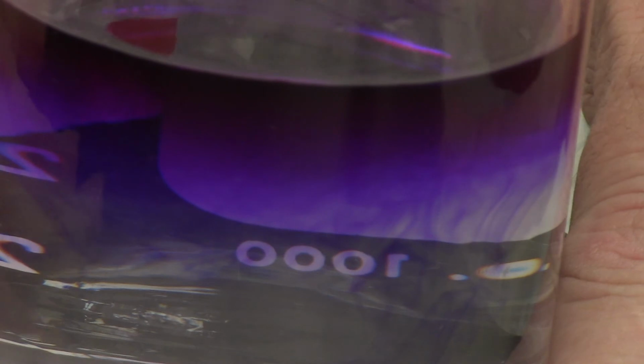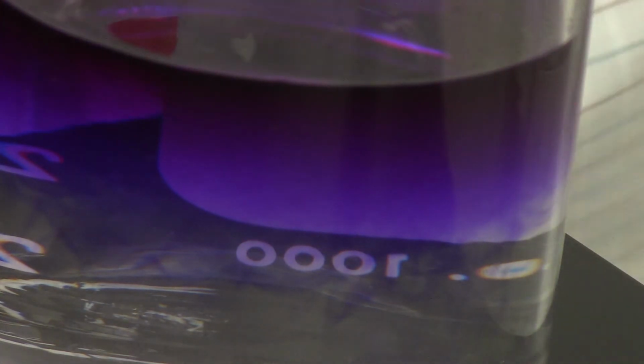So here's our crystal violet solution. It's just kind of cool because it's an alcohol base. Right now it hasn't mixed. That alcohol is a little bit less dense than the water down below. So once I stir that, then it'll mix. This is also a nice way of showing densities. So I'm going to take this and give it a swirl. And it mixes quite nicely. Okay. So here's our crystal violet solution.